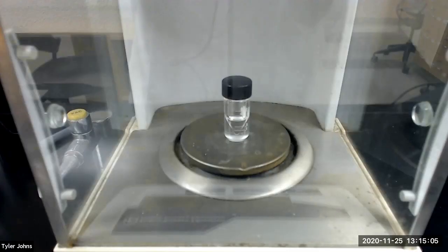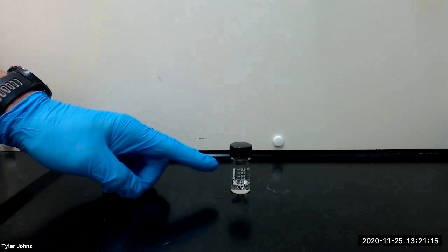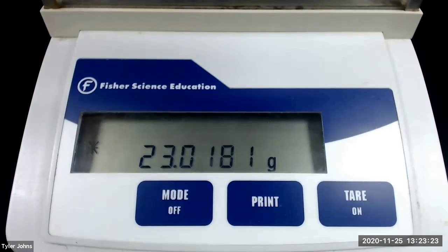After performing the fractional distillation, the mass of our pre-weighed 3 milliliter conical vial and the collected distillate is 24.0268 grams. We next need to pre-weigh a new 3 milliliter conical vial which we will be using to determine the density of our distillate. The mass of this pre-weighed 3 milliliter conical vial is 23.0181 grams.